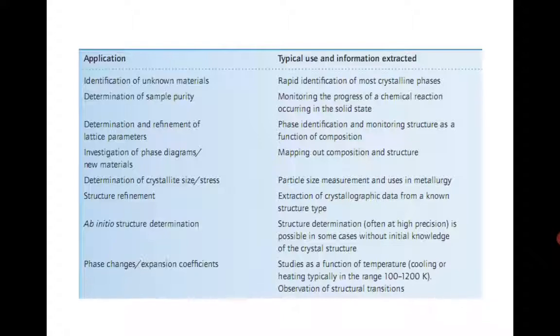In recent years, the technique of fitting the intensities of the peaks in the diffraction patterns has become a popular method of extracting structural information such as atomic positions. The analysis involves fitting a calculated diffraction pattern to the experimental trace. This is known as the Rietveld method. This technique is not as powerful as the single crystal methods, for it gives less accurate atomic positions, but it has the advantage of not requiring the growth of a single crystal.